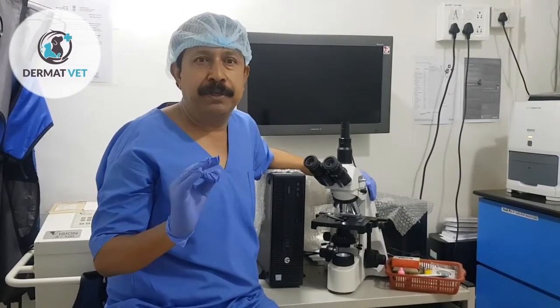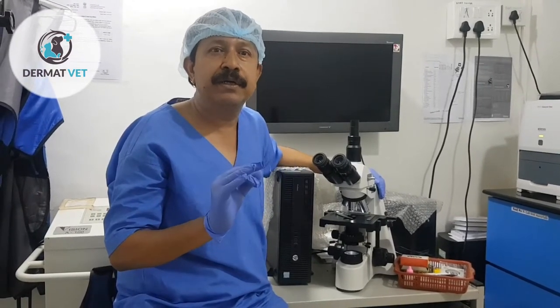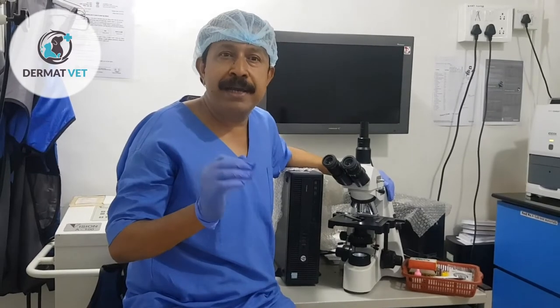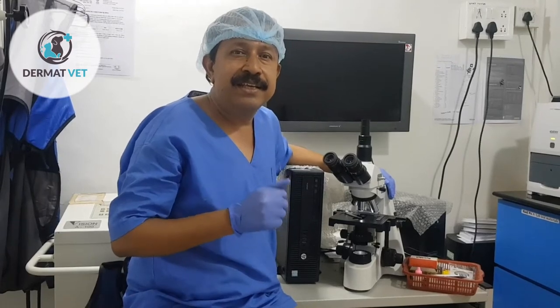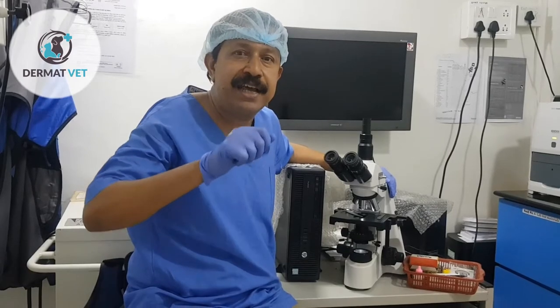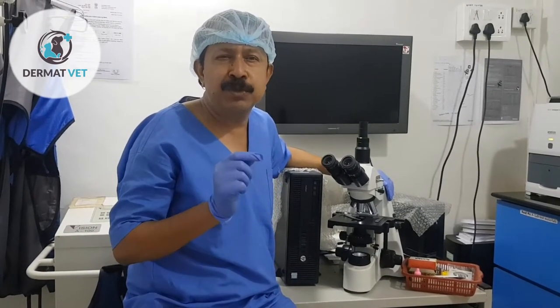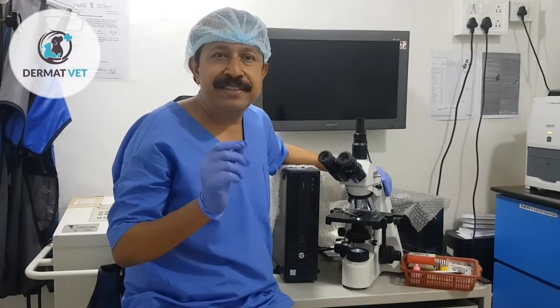Avoid thick specimens. Take multiple samples on the same slide using different sites. Samples from intact pustules are obtained by gently rupturing the pustule with a sterile needle. Samples from crusted lesions are obtained by lifting the crust and getting the sample from beneath. It is very simple to collect specimens using the glass microscopic slide.